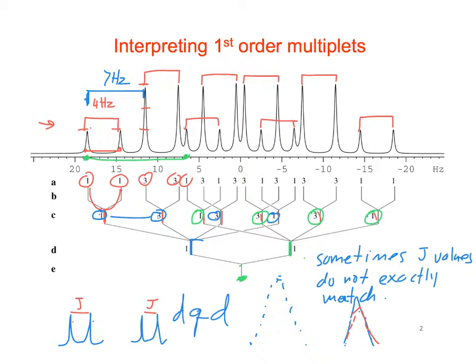So it's more of a data sampling issue than that the coupling constants aren't matching. And this is the math part where the software knows to extrapolate out and not just connect the dots with lines? Well, I don't think that it really does. It can't find the tip unless there's a point up there.